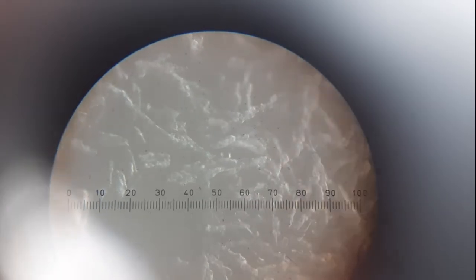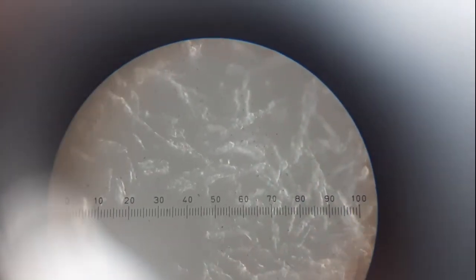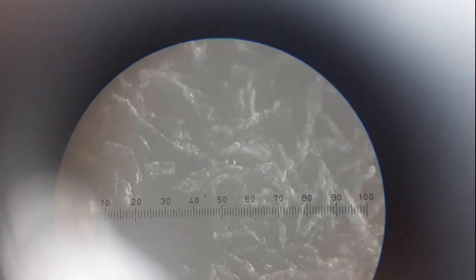These are the crystals for the last 60 minutes, and the average particle size determined was 78 units of the eyepiece. Now we will proceed with the observation table.